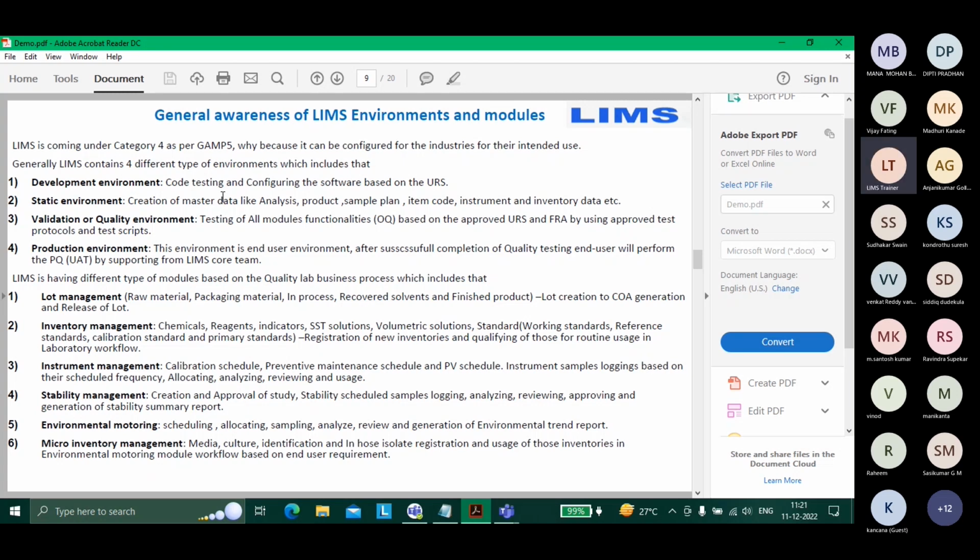There are even some more modules, for example project management modules. Then you have folder management, where you place the samples or tests in certain folders. So you have different kinds of modules. As time progresses, these software products are upgraded and more modules are added. So there are a lot of modules. We have named some of these here. Just remember that every LIMS tool built by the best vendors has a lot of modules, and inside those modules we have a lot of sub modules.